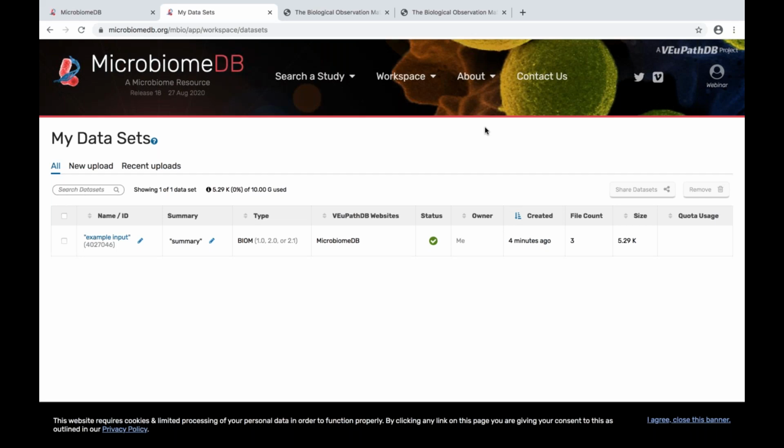So to today's audience, maybe a challenge to you: if you have a biome file from an 18S, for example, or ITS analyzed data set, try it out, see how it works, and then click on contact us and let Dan and Wojtek know how it ran and what kind of problems you may have run into.